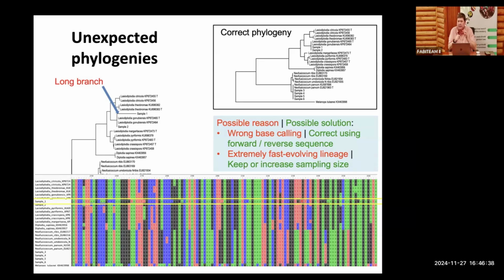And you will probably see that there's actually more T's called in the forward direction or the reverse direction, and you can fix that. So that is then really easy to fix. You cannot fix really anything that's deposited on GenBank. That's there, it's there. I would not touch it. That's my personal opinion. If you differ from that opinion, that is your prerogative, but I would not.